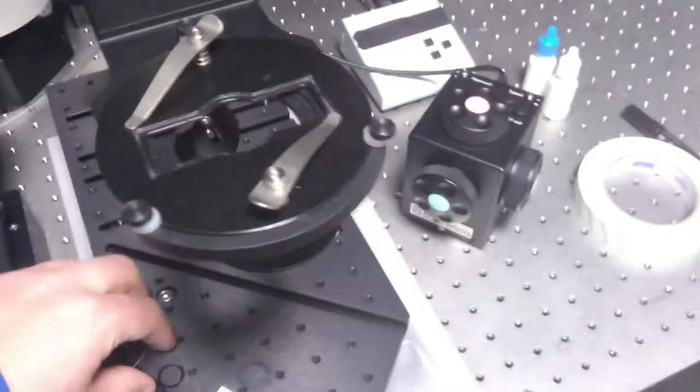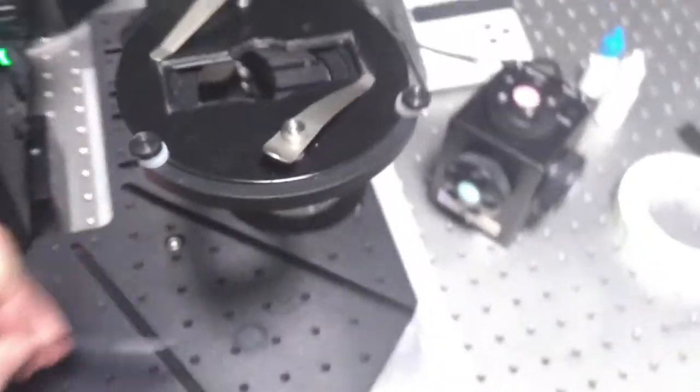Hello, this is a short instructional video on how to put a sample properly onto the upright confocal microscope.